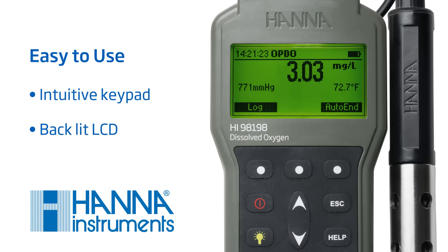This user-friendly meter features an intuitive keypad design and an easy-to-read screen with backlight.